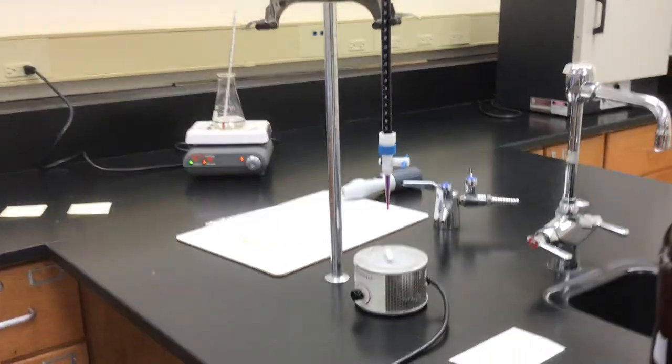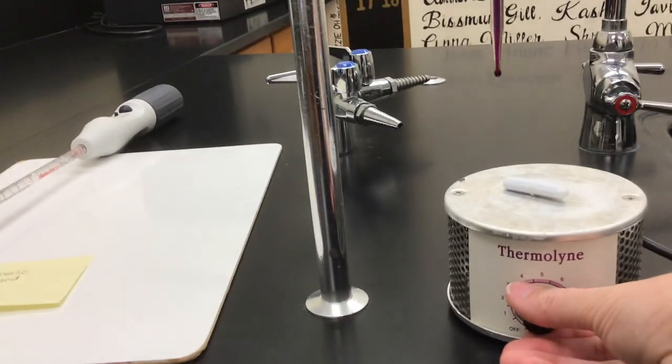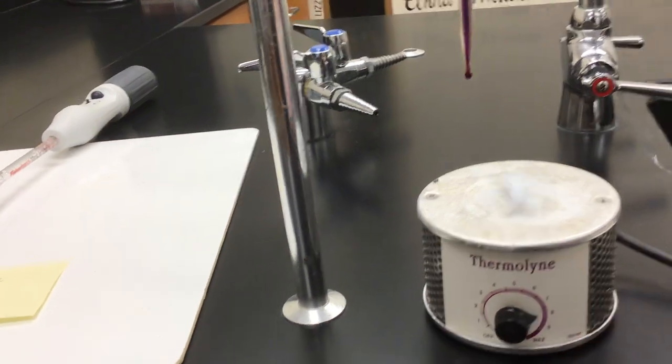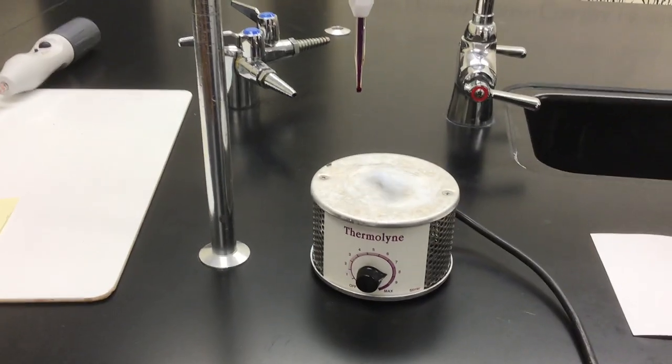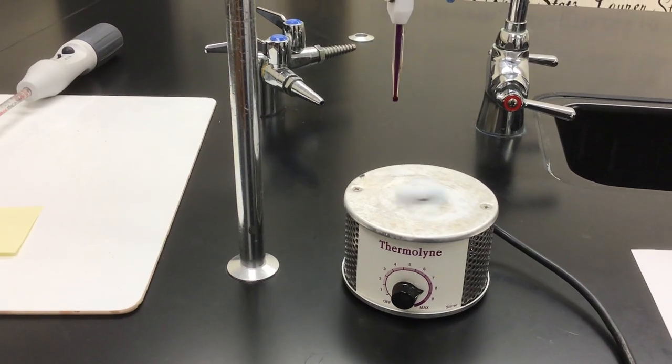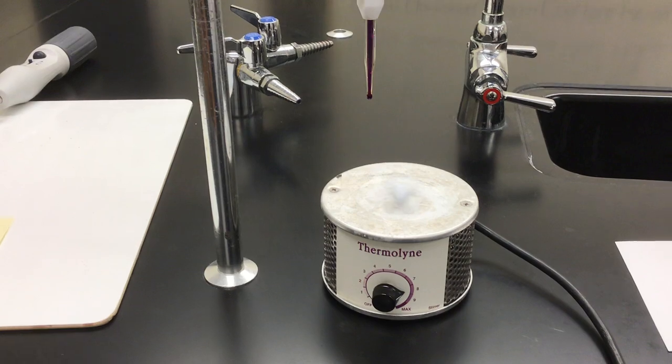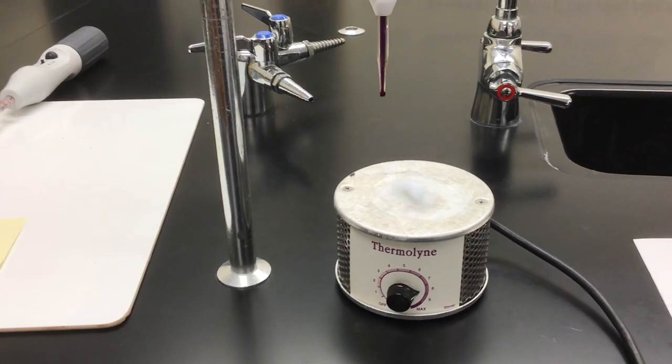If you haven't seen an auto stirrer before, what that guy is all about, I'll turn it on real quick for you to see. There's a little magnet at the top of that thing, and we're going to put that magnet into our oxalic acid solution in just a minute. And it will do the swirling and stirring of our solution for us.